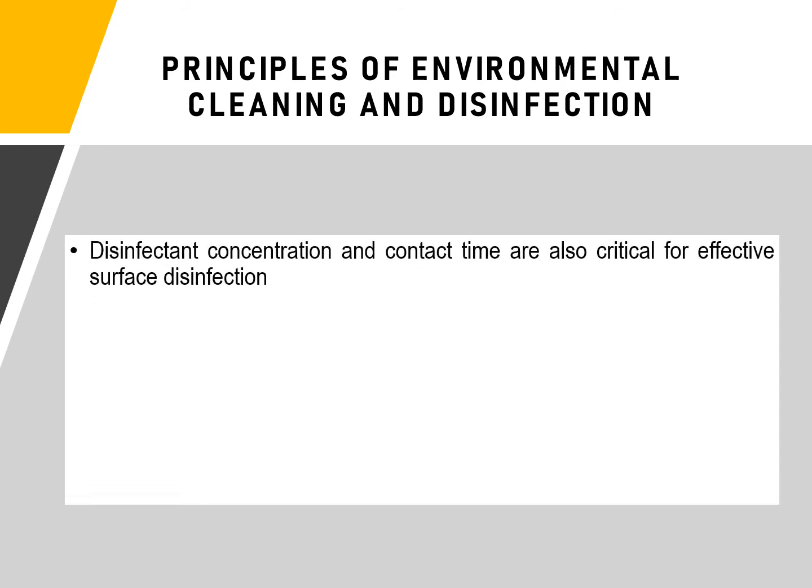The concentration and contact time of a disinfectant are also critical for effective surface disinfection. Disinfectant solutions must be prepared and used according to the manufacturer's recommendation for volume and contact time. Concentrations with inadequate dilution during preparation, like too high or too low, may reduce their effectiveness. High concentrations increase chemical exposure to users and may also damage surfaces.